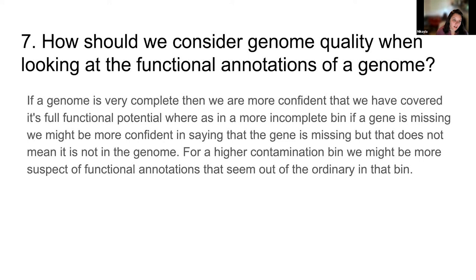Why is quality important? Yes, we need to report it according to Bowers et al., but when we're thinking about annotation, this should also be considered. The raw annotations.tsv will also import this information. If you have a really highly complete genome and you're missing genes, you might be less concerned about it. But if you have a really low quality genome and you're missing, say, a large portion of the TCA cycle, but it has all the other parts for respiration, then you might consider how you're calling those genomes' metabolism. DRAM has imported all of that information into one file so that you can assess both quality and function at the same time.